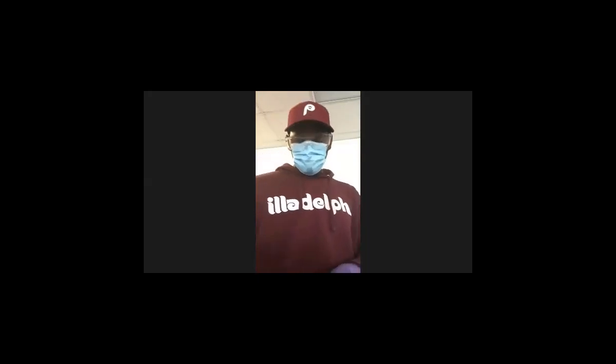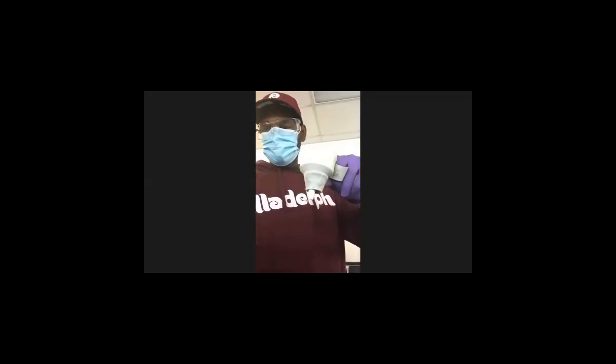But you can't seal it up without either a stopper or a filter adapter, which is what this thing is right here. So this goes here into your funnel, and then you just sit it down in here, right? And if the filter flask is too big, you can flip it over like that and sit it on top. And both ways, you're going to get vacuum. Either way, it doesn't matter.